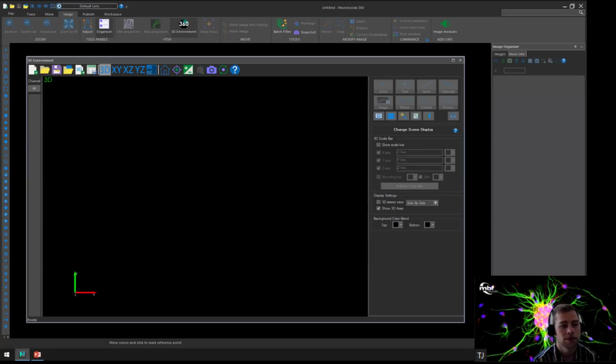The program I'm going to be running on today is NeuroLucida 360, but everything that you see today in this program is also applicable to VesaLucida 360. So just because we're in one does not mean it's not applicable to the other. That double negative is just, it is what it is. It'll work in both programs as you see it.